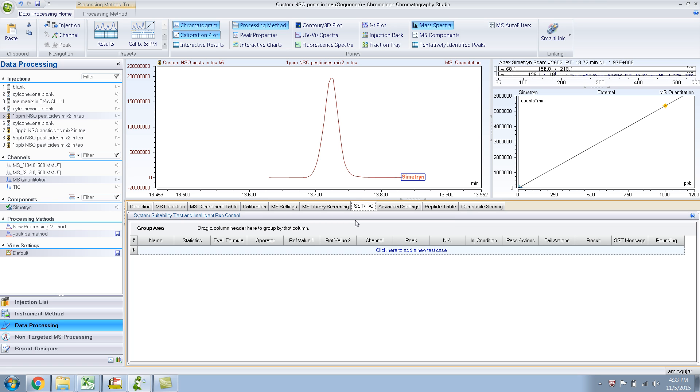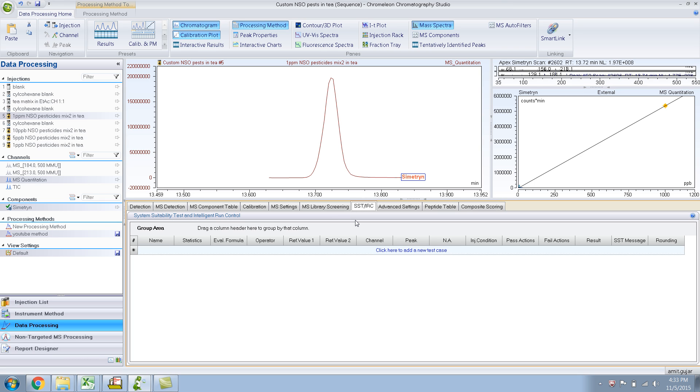Basically you can control, depending on, say maybe in situations like where you have to pass a certain criteria, right, like say your peak asymmetry if it falls above 1.2, 1.5, then do this, then don't run your next sample because you have to do maybe conditioning the column or whatever. It's pretty smart controls and you can try this if you want.